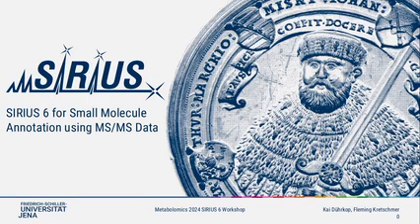We want to talk about the software SIRIUS and how to use that for the annotation of LC-MS-MS data. The workshop will basically start with a presentation about the software, and then we will do a live demo where you can follow the steps on your laptop, and also feel free to ask questions if you have any problems.